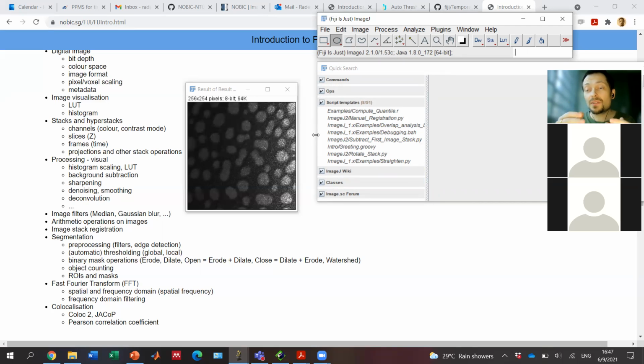In a way, the 3-dimensional information can be taken into account only if I move away from this pixel-based segmentation. What I did, this thresholding, is something I can call pixel-based segmentation, because I basically look at each individual pixel at a time and look, is it higher than the threshold?